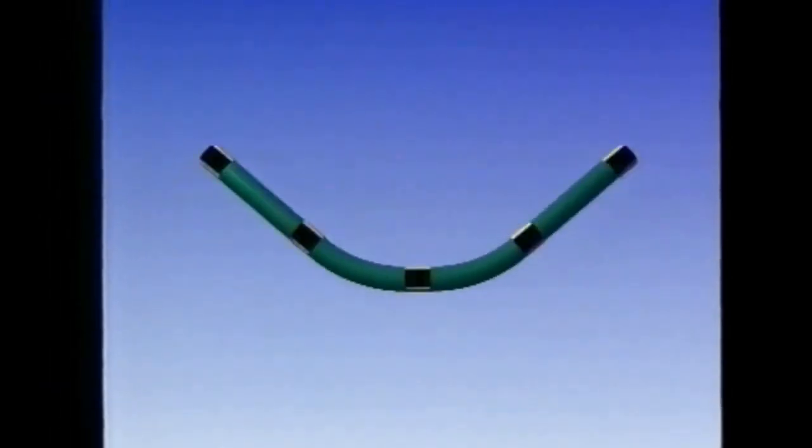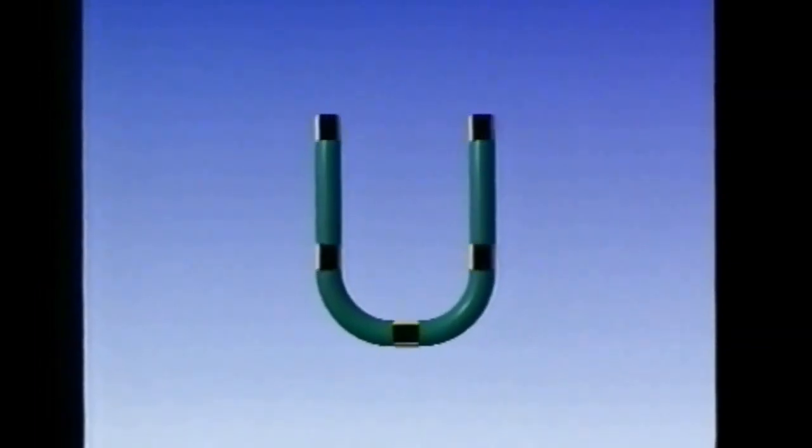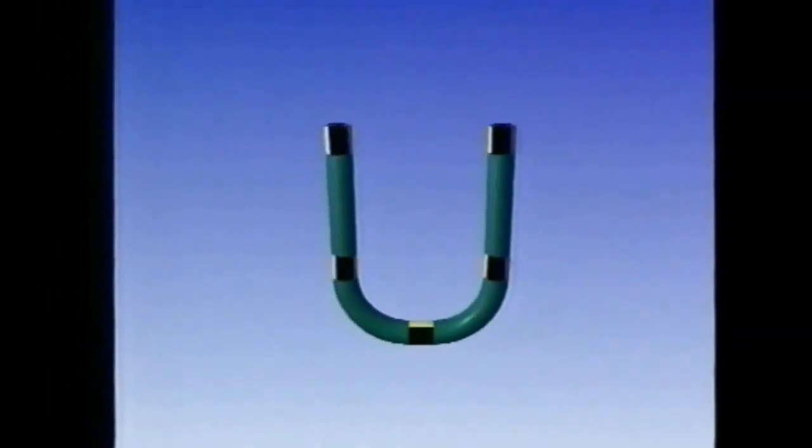If the tube is flexible enough to form a U, then it can still be rotated, but when the ends are brought together, notice that they're actually rotating in opposite directions.